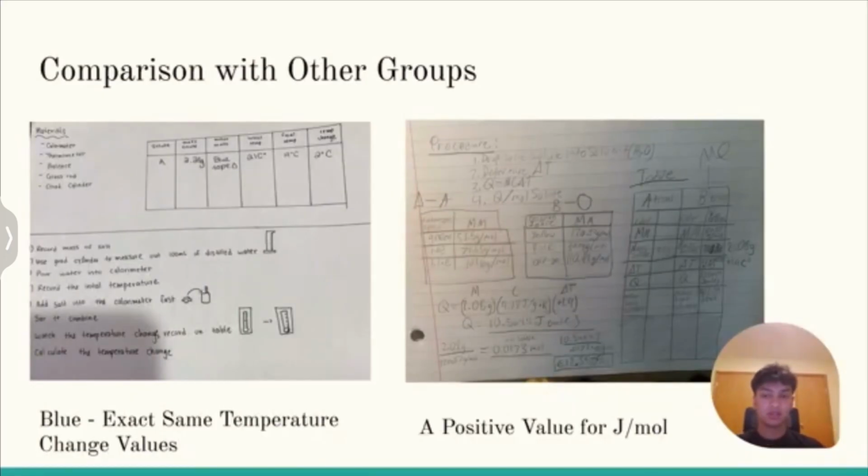For future research and to expand on this, we could use different solvents aside from water and maybe use different amounts of solute to see how it affects temperature change.